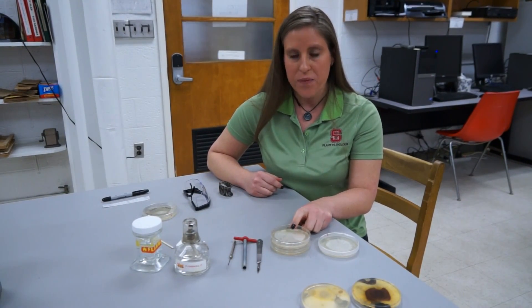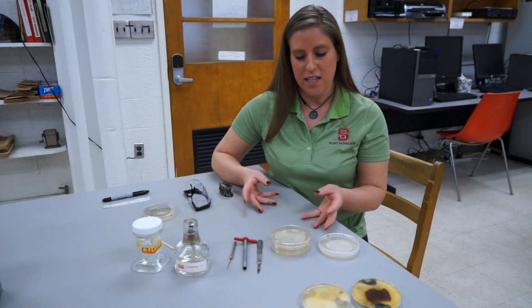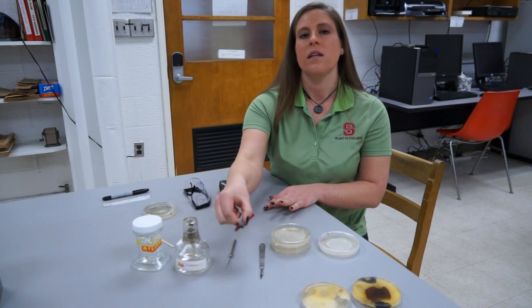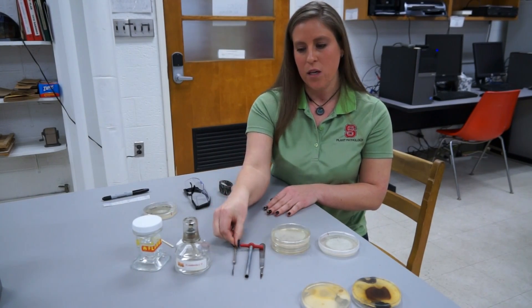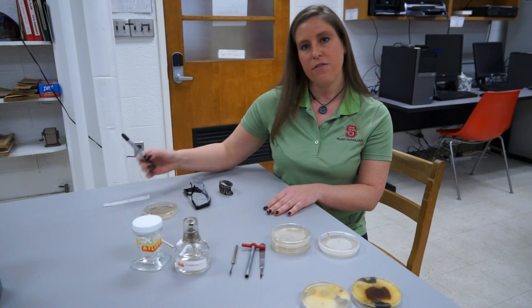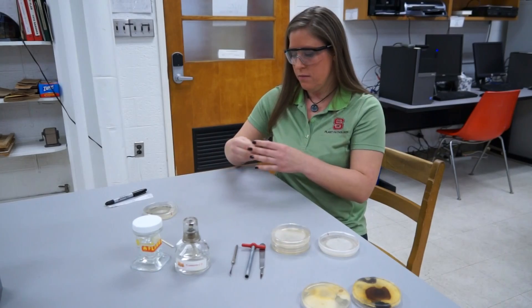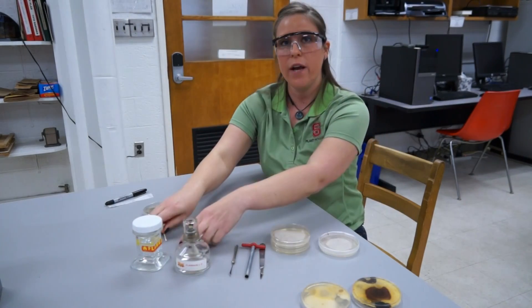We also need to transfer it to a growth medium. Today we're working with potato dextrose agar, which is a semi-solid, jelly-like substance that has nutrients in it. The tools we use to transfer are our scalpel, cork borer, and spatula. We also need alcohol, an alcohol lamp, parafilm, and a marker. And we need our safety supplies — put on your goggles and put back your hair.